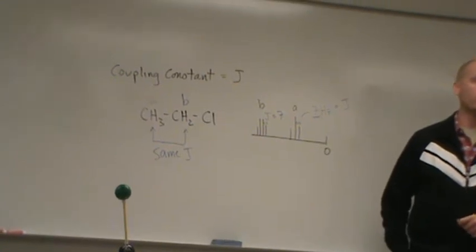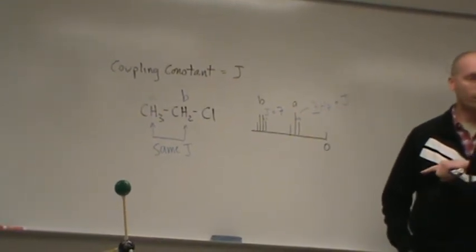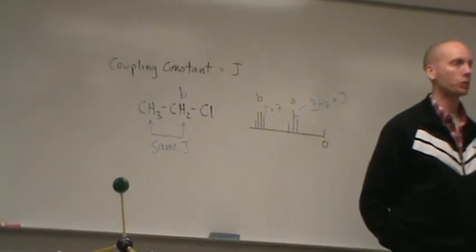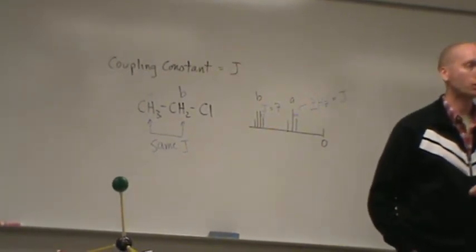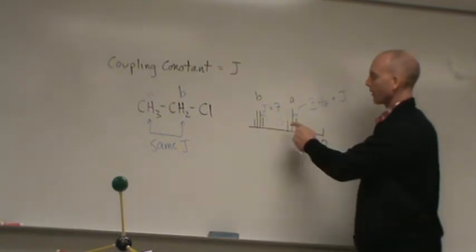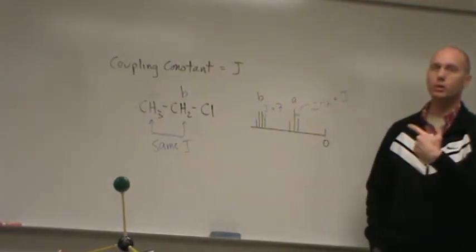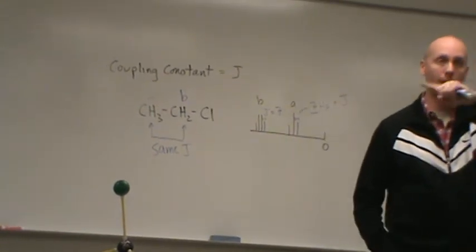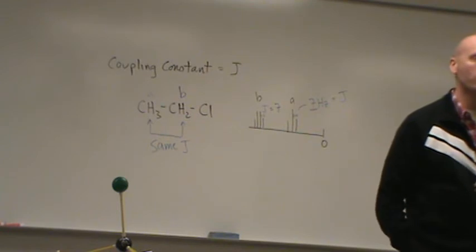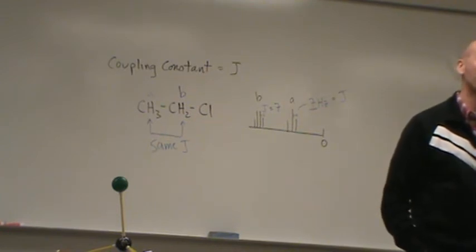That's a simple molecule. But if I had a complicated big molecule where I had lots of hydrogens and lots of peaks, you see how that could be helpful? I could then say, okay, those two particular peaks had the same coupling constant, so they must be splitting each other, or those hydrogens must be next to those hydrogens representing those peaks.